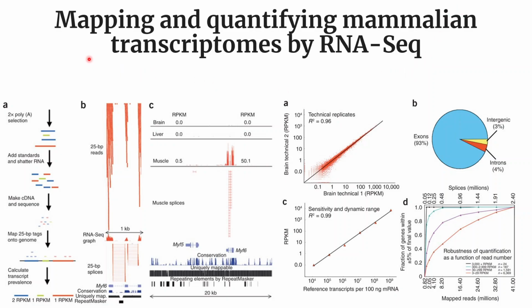In this video we will discuss how to map and quantify mammalian transcriptomes by RNA-Seq technology. In simple terms, we will understand how we can quantify different levels of RNAs that are present within the samples, especially in the mammalian samples.